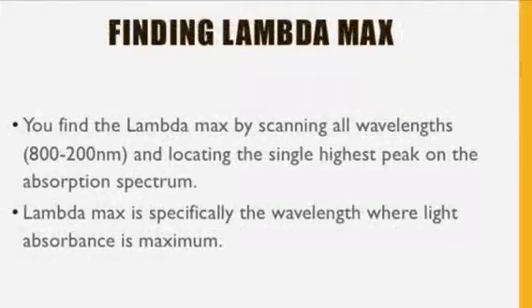Finding lambda max. You find lambda max by scanning all wavelengths and locating the single highest peak on the absorption spectrum. Lambda max is specifically the wavelength where the light absorbance is maximum.